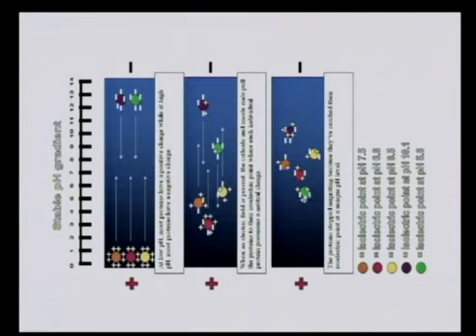That means this particular protein or ion has an isoelectric point near 5. The table shows the green one has an isoelectric point of pH 5.6, the red one is somewhere around 7, and the yellow one is somewhere between 8 and 9.